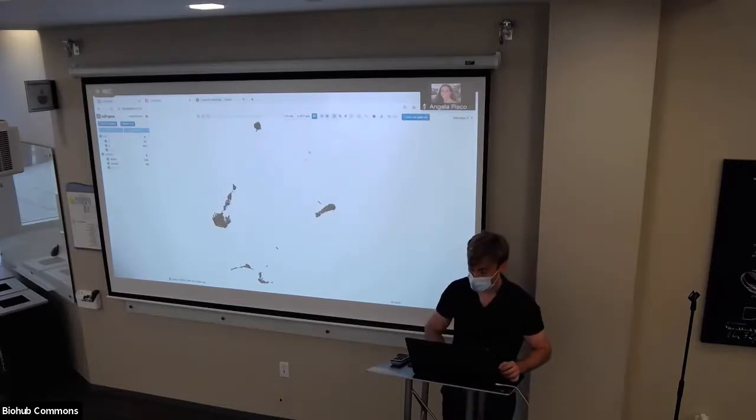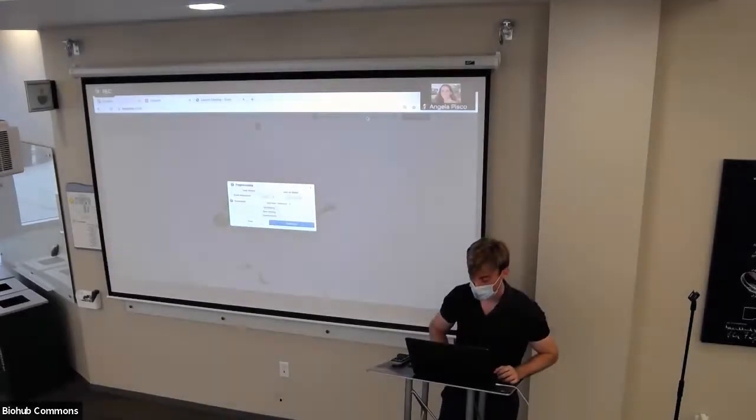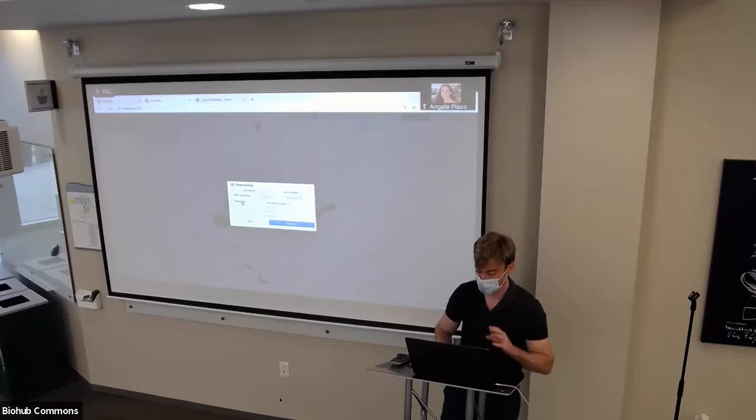So we're going to open up this pre-processing menu here. And so we have a lot of buttons that we can click. The first, the most important button is, do you want to pre-process your data? I don't know why you would uncheck this. Well, actually, you would uncheck it for a specific reason, which I'll go into. But if you uncheck it, then you just wouldn't use this menu.